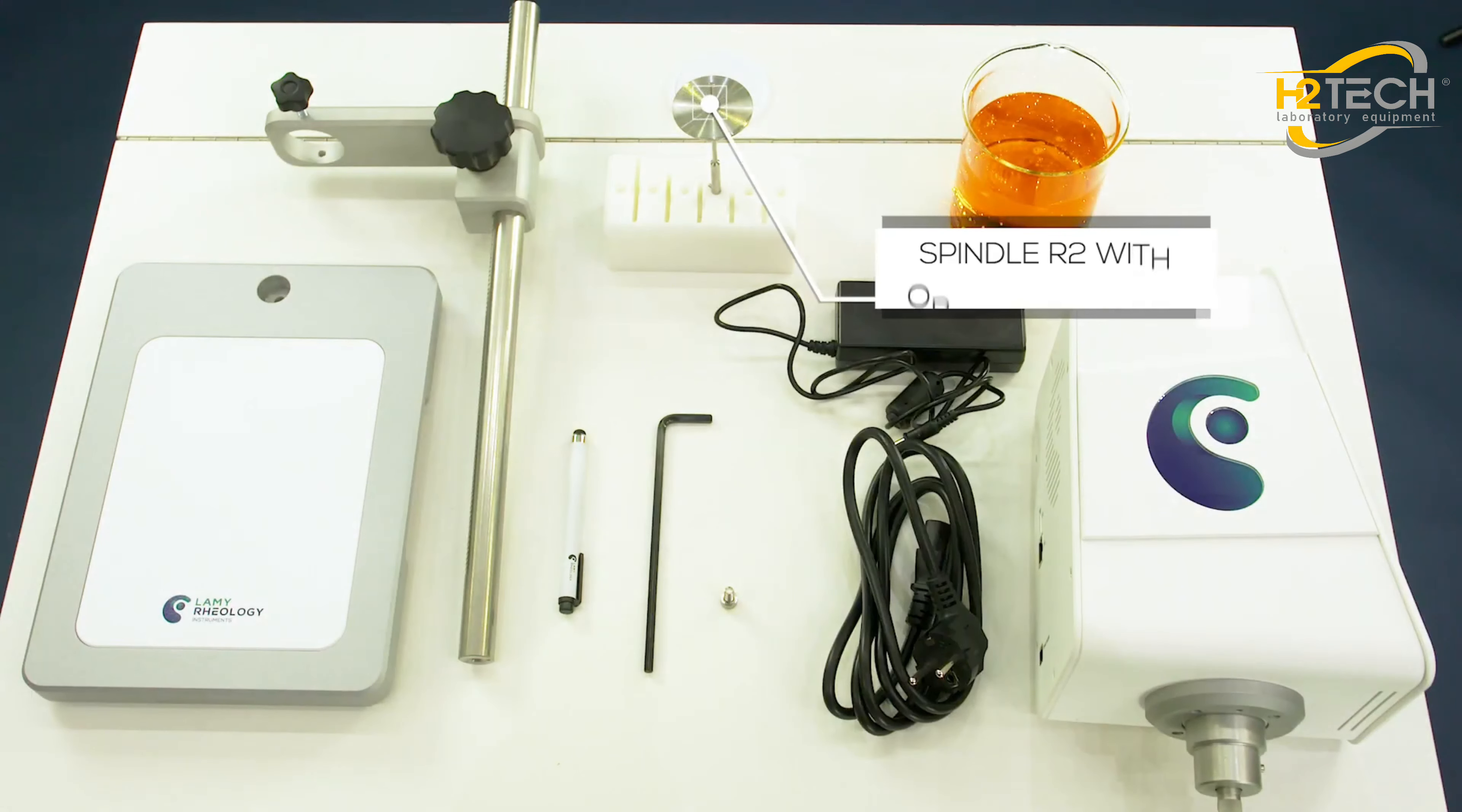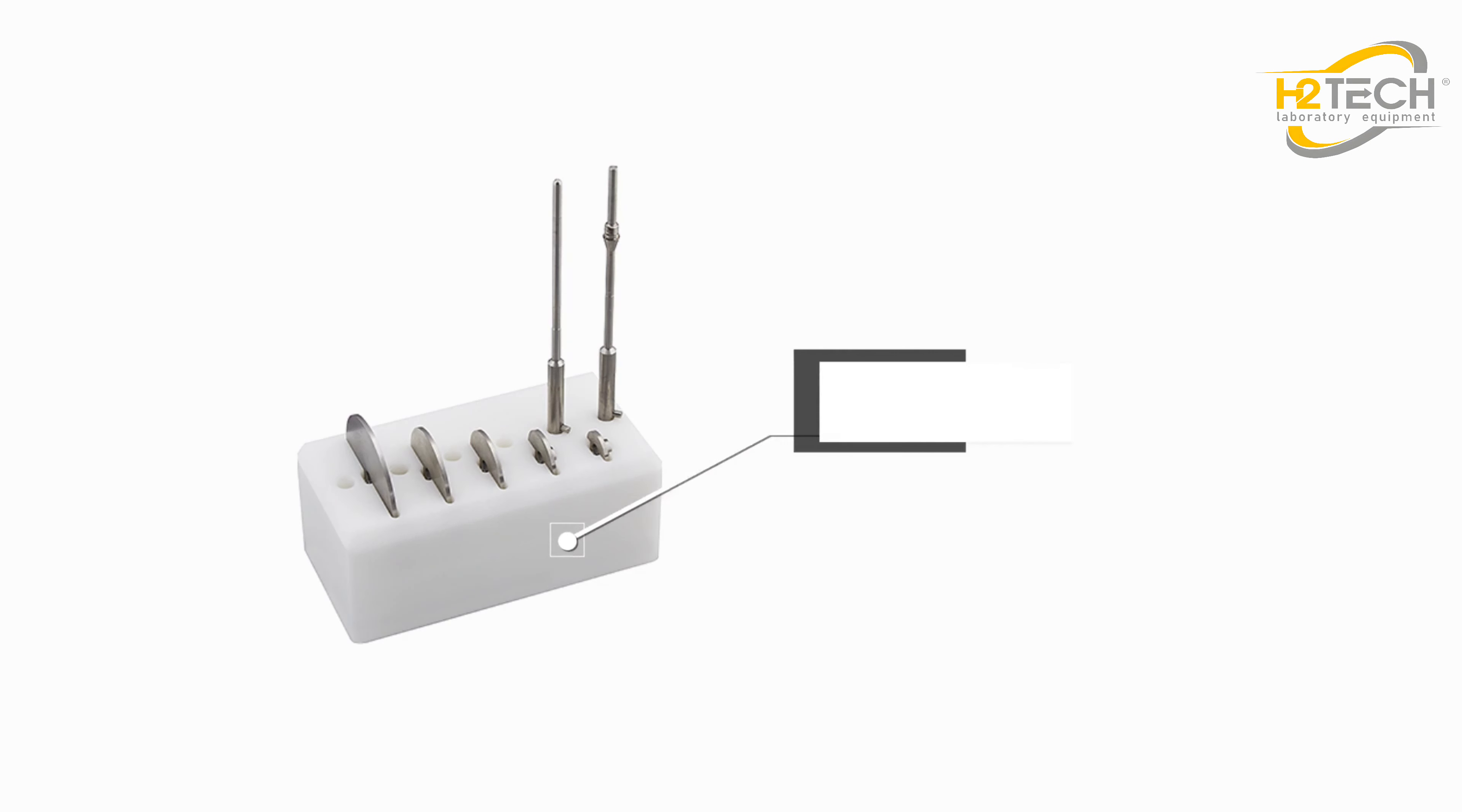Unpack all accessories from the box according to your configuration. A complete set of ASTM R2 to R7 spindle can be delivered with the device.